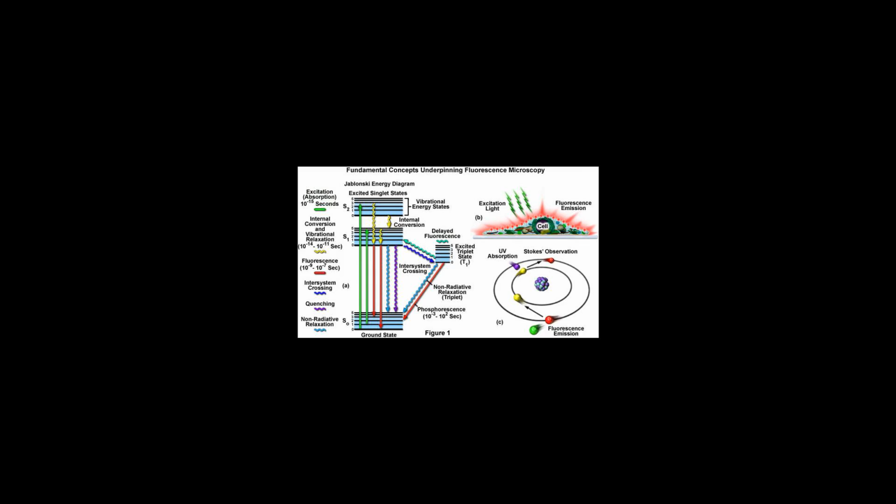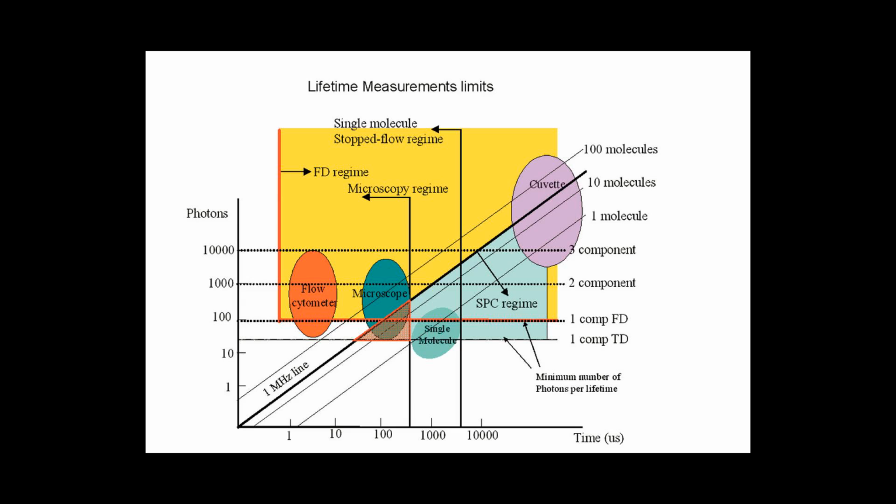Applications. FLIM has primarily been used in biology as a method to detect photosensitizers in cells and tumors, as well as FRET in instances where ratiometric imaging is difficult. The technique was developed in the late 1980s and early 1990s. Gating method: Bugiel et al. 1989, Koenig 1989. Phase modulation: Lakowicz et al. 1992.